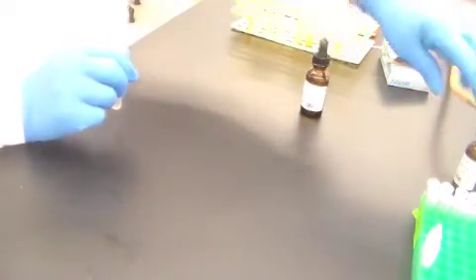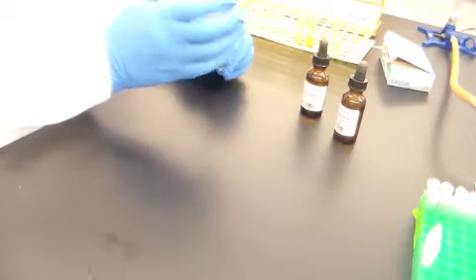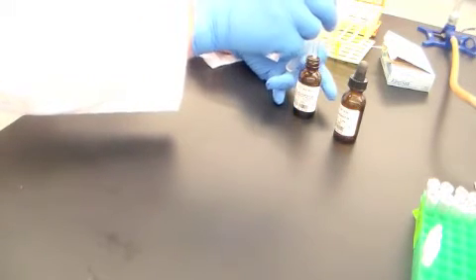So the 2 chemicals that you're going to add here, appropriately enough named nitrate A and nitrate B, are a combination of sulfanilic acid and dimethylnaphthylamine. These reagents will give a bright red azo dye if nitrite ions are present. So this test is highly specific for nitrite ions.